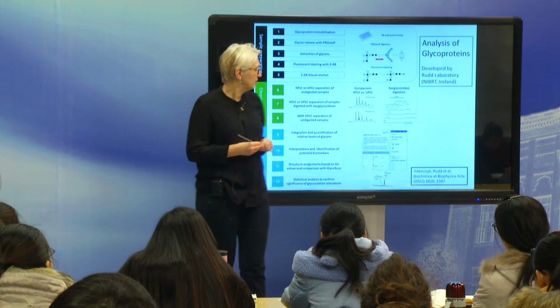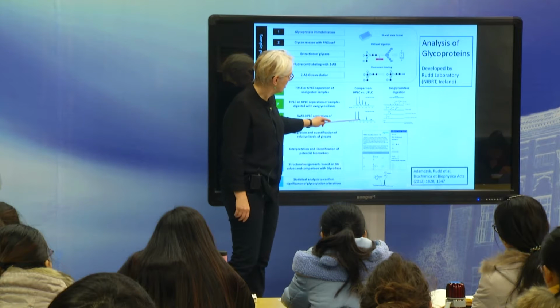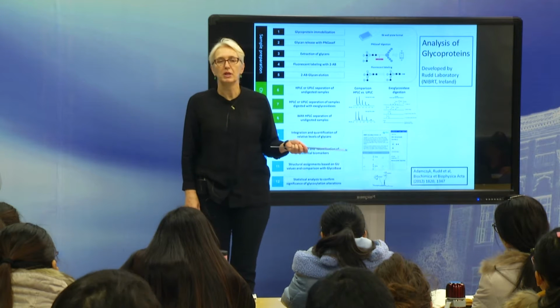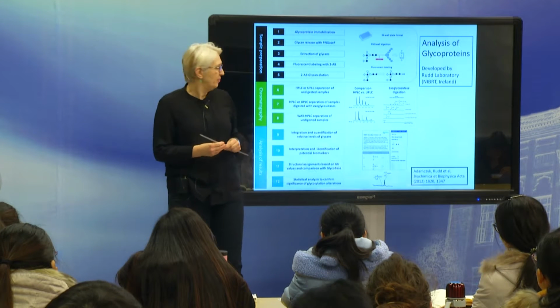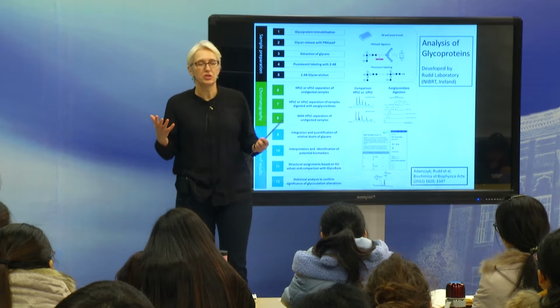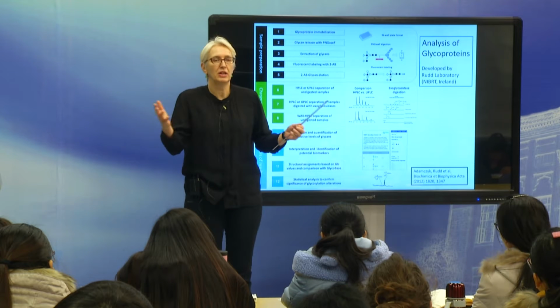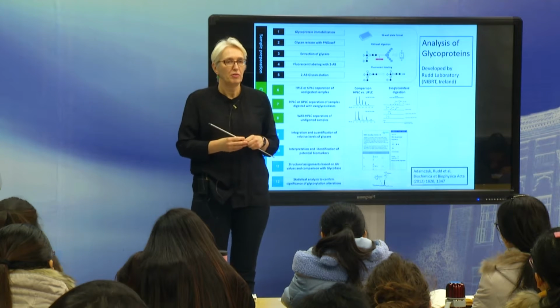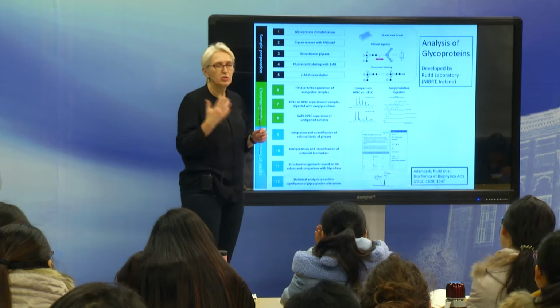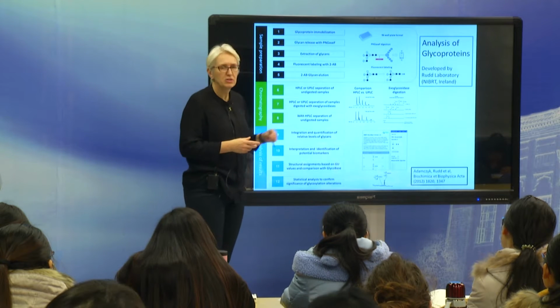It's very effective and gives you very good information. Some ambiguity, but you actually start knowing what's really under each peak, and then you can combine that with your mass spectrometry. And in addition, you have a fairly good understanding of the biosynthesis, the structures of N-glycans you have in biology, because again, you can go back to a massive amount of biochemistry where people have studied these biosynthetic pathways. So we have a good expectation. We know roughly what structures we would expect from these samples.